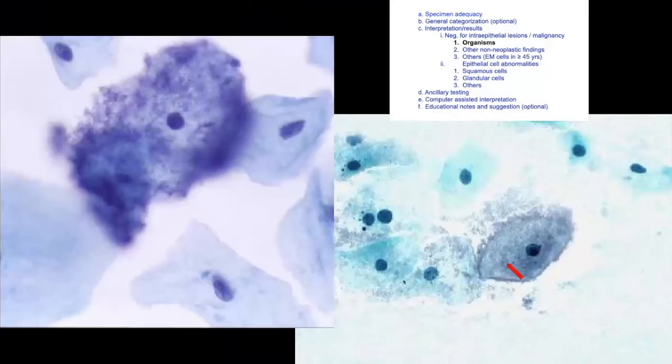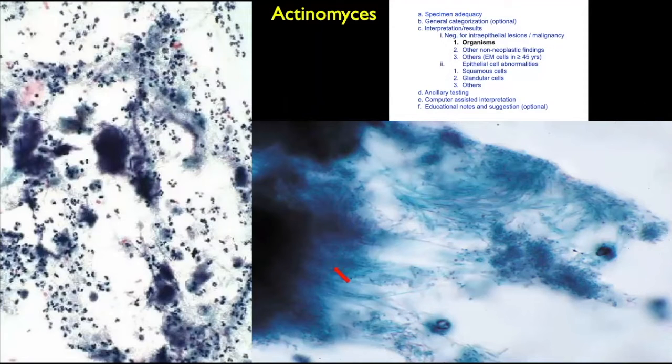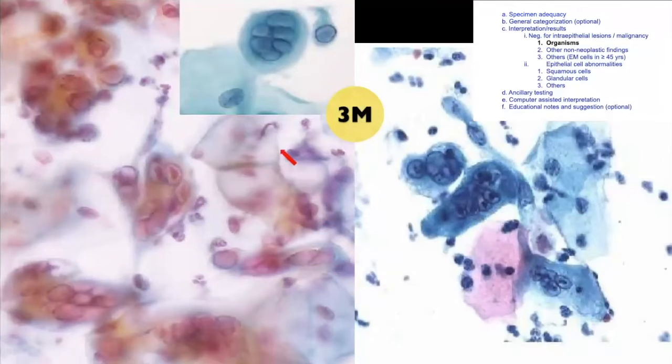Here you can see fuzzy organisms sticking to the cytoplasm — these are known as clue cells, an example of bacterial vaginosis. Here you can see a 'cotton candy' appearance — balls of filamentous organisms with increased neutrophils. These filamentous organisms may take a pink or green color and are characteristic of Actinomycosis. Always ask for the history of intrauterine devices, as Actinomycosis is more commonly seen in IUD users.